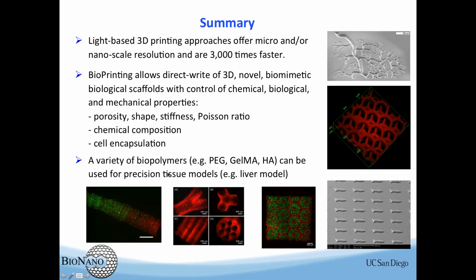So we have also demonstrated the use of various biopolymers such as polyethylene glycol, gelatin, hyaluronic acids, and their combination for precision tissue models.